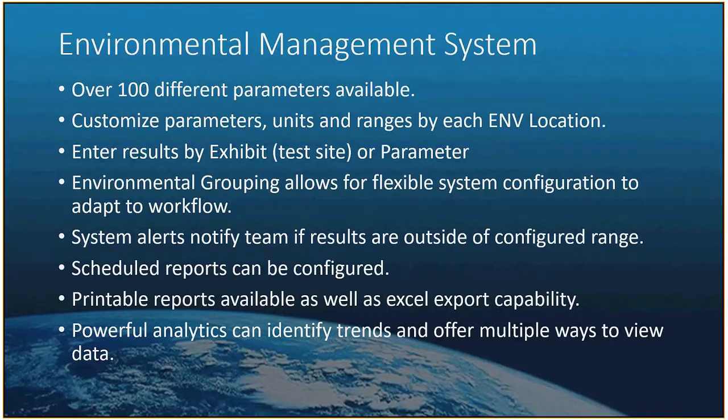We did build an environmental grouping tool as well, and this is at the facility level. When you're logged in within your facility and you go to settings, you have the ability to group locations. Why would you do that? We understand that you might have numerous tanks on one system, and you're only taking one sample that represents maybe 5 tanks. Instead of entering results for 5 tanks, the grouping system allows you to designate one as the representative test site for a group, and that's the only test site that will show up when you enter results. It will automatically copy those results to the other members of that group. It's a convenience tool that can save you a lot of time.